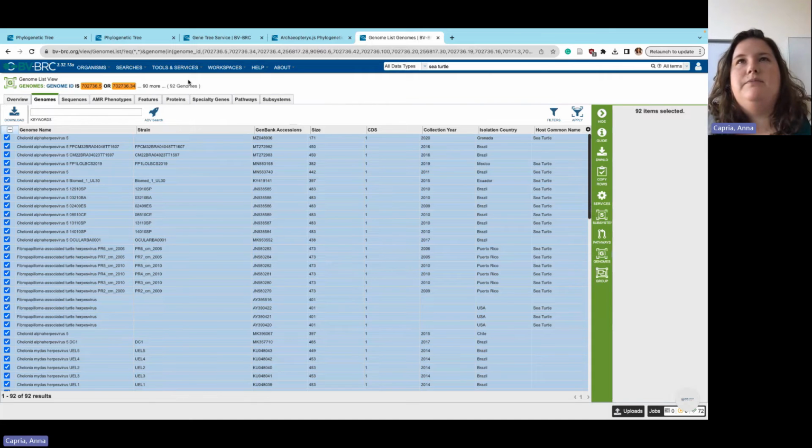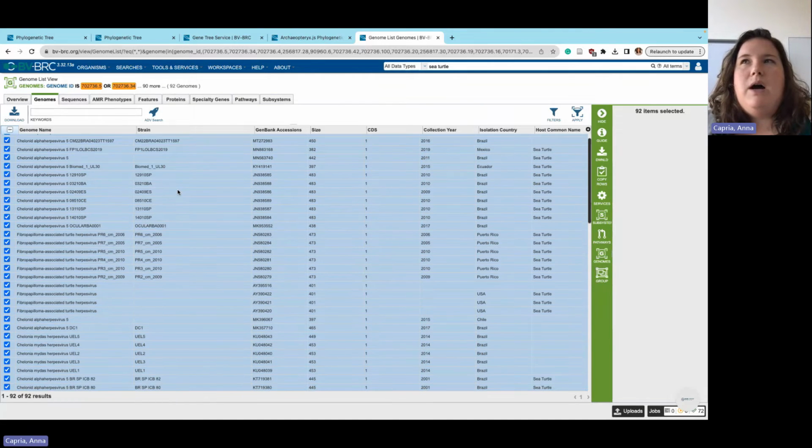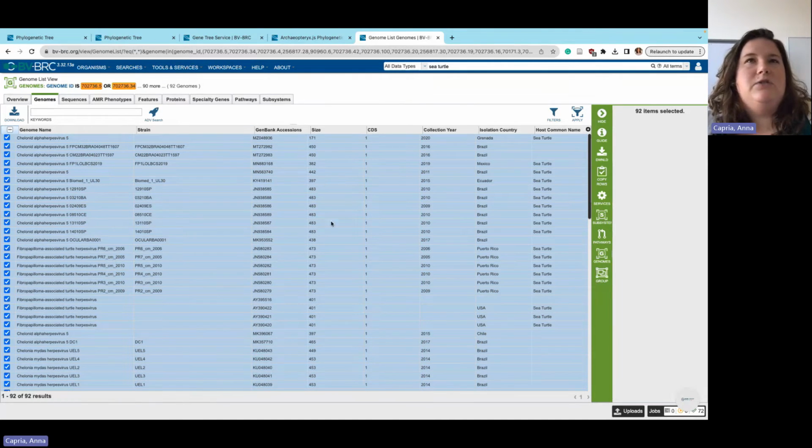The reason I decided to use the DNA polymerase for my comparison is that I know those sequences will all be similar, because it's comparing the same thing. That is something you want to keep in mind, especially if you're working with a segmented virus or something a little more complicated. You want to be able to have common points that will allow you to make your comparisons.